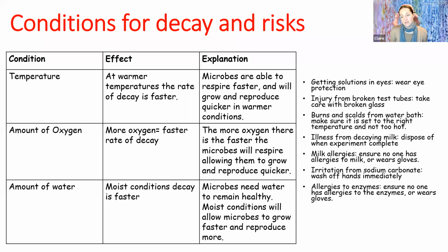Risk factors. But anyway, be careful of things going in eyes, test tube glass smashing, cutting yourself, burns and scalds from the water bath. You're dealing with different temperatures. Please do not drink the decaying milk. That's just disgusting. You could have allergies to milk, so please be careful. Wear gloves. Things like that. So I've just put a range of ideas there for you.